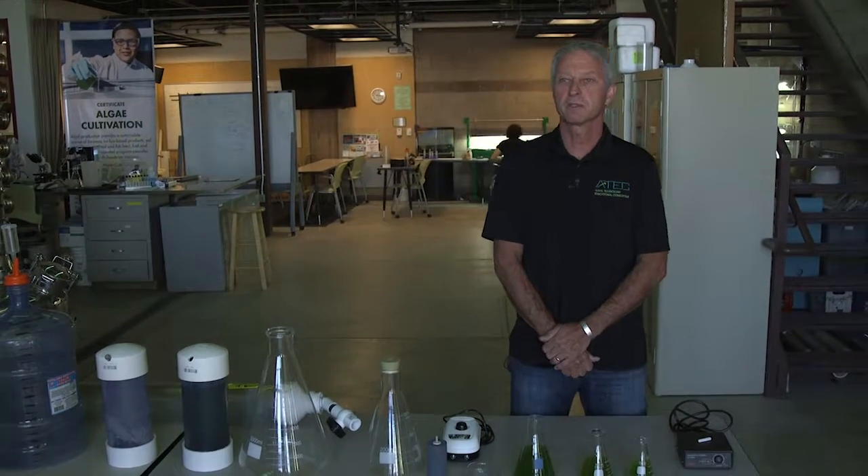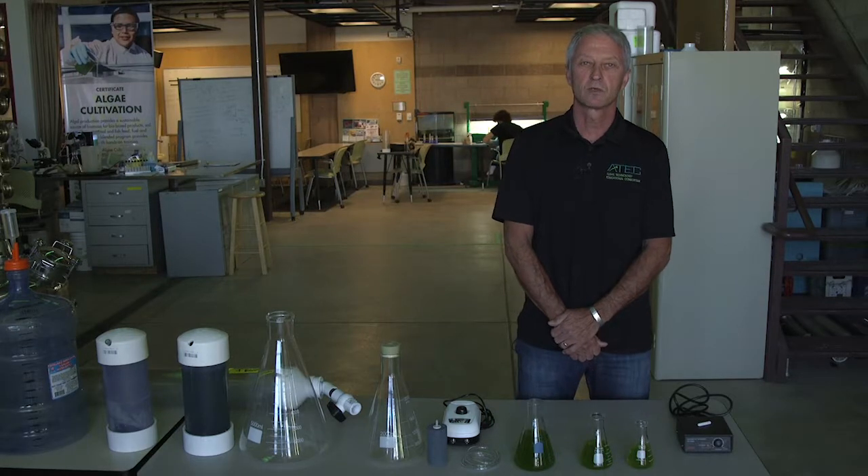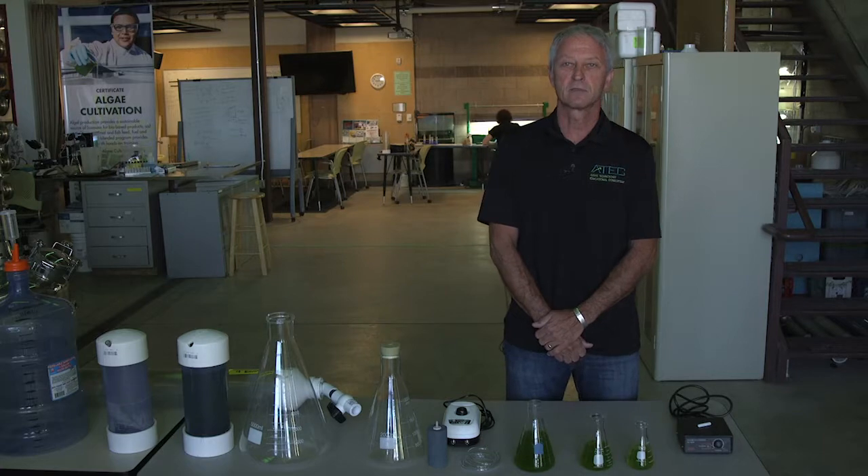Hi, my name is Luke Spangenberg. I'm the director of the Biofuel Centers of Excellence at Santa Fe Community College, and we're here to talk today about scaling up in photobioreactors — different methods, different materials.